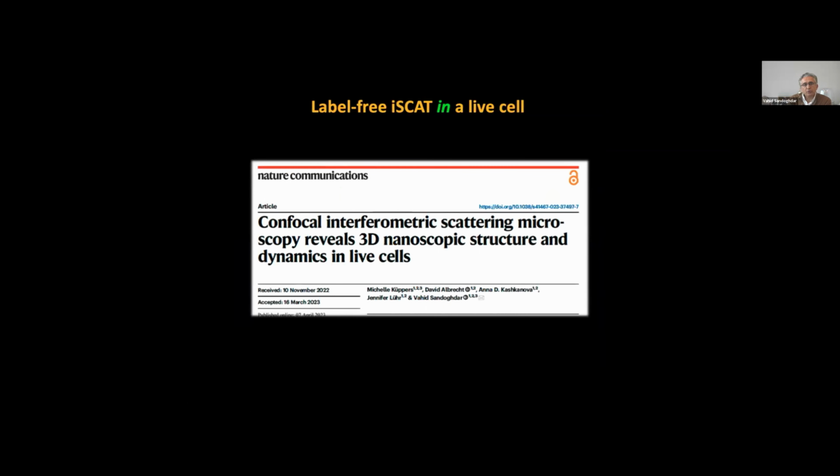So now I come to the second part of the talk, which carries the title. In this recent work, we showed that if we do confocal iSCAT, we can go inside the cells and get an extremely good signal.